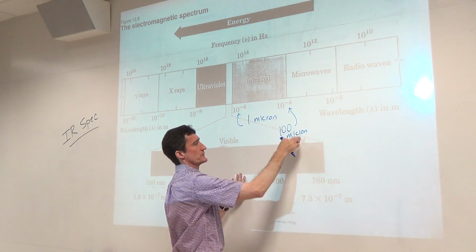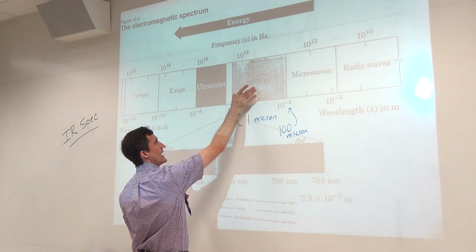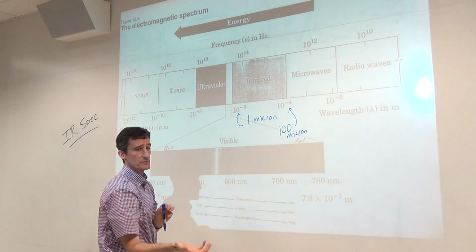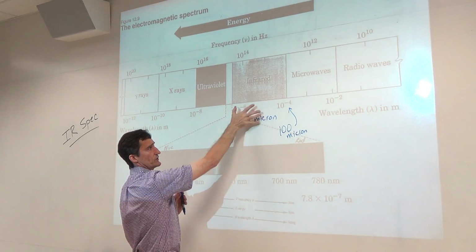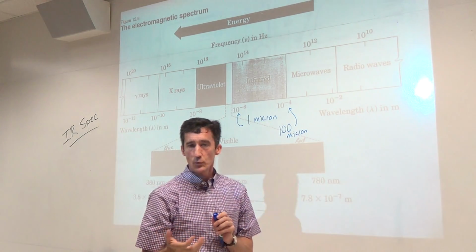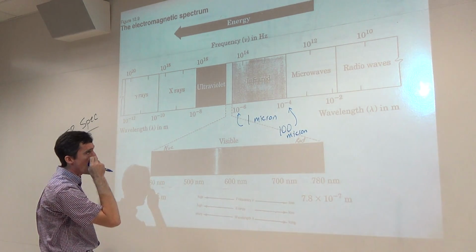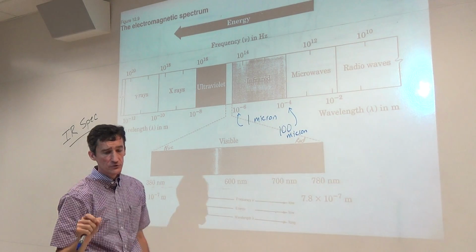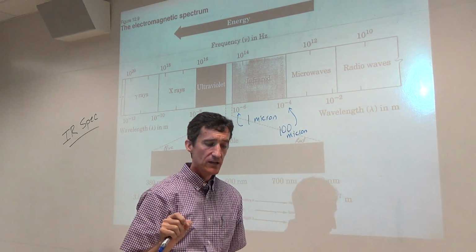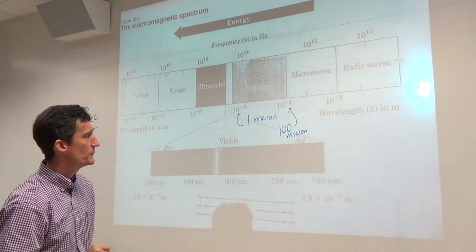Or micrometers. Okay? So indeed, the IR, if you convert your wave number to microns, you'll see it's a couple of microns, typically here, 2, 5, 20 microns in terms of wavelength. However, usually we will discuss frequency more often than wavelength when we talk about IR.